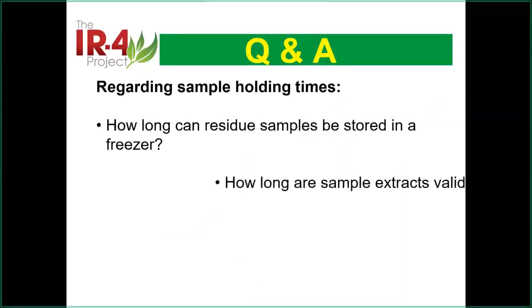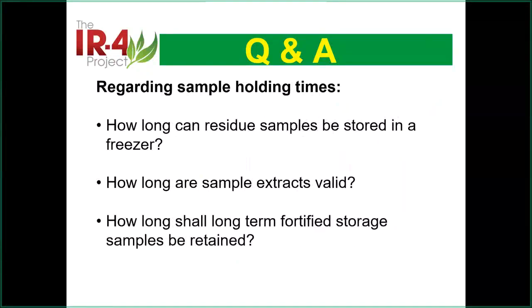Another question, actually several of them. We talk about the laboratory work. How long do you need to keep your samples? For example, the field sample. Okay, you put it in the freezer. So we are talking about a holding time here. How long do you hold them? The residue sample from the field, how long do you need to keep them after the analysis? And also in the lab, after you do the extraction, we are talking about sample extracts. How long do you need to keep them?